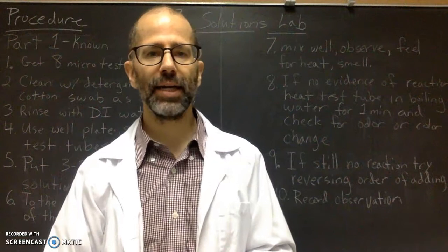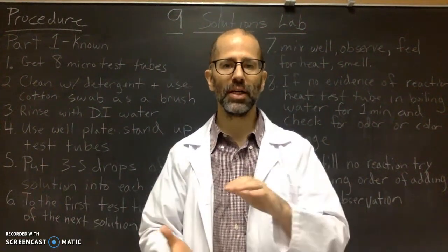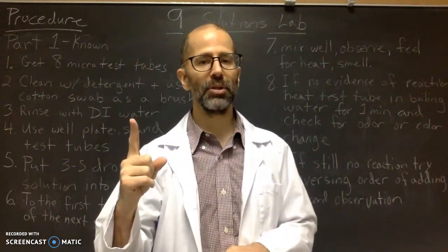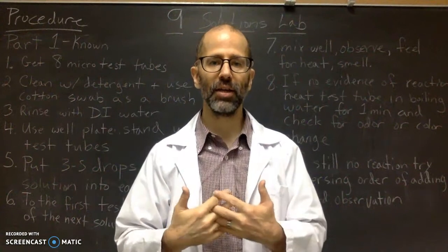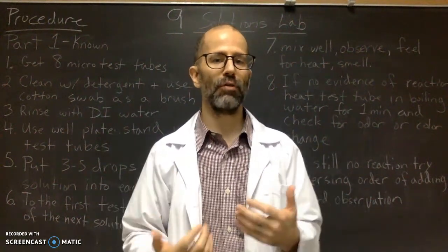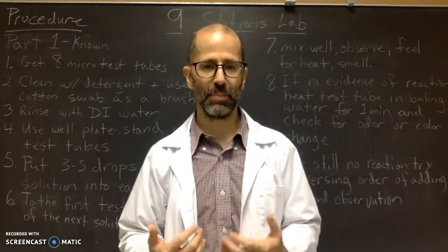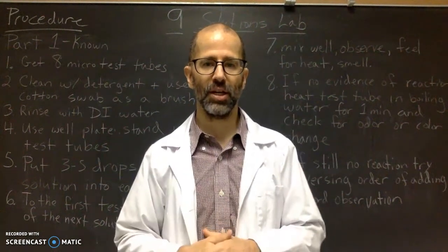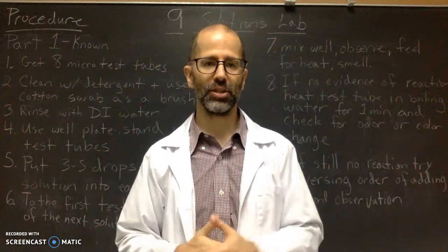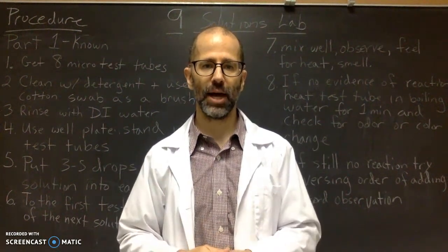So what's going on in this lab? There are 2 parts to this lab. Each part is going to be done on each day. So it's a 2-day lab. The first day, you're going to be mixing 9 solutions together in various combinations and observing whether or not you get a reaction and what's going to happen. So you're using your skills of observation to detect any reactions going on.